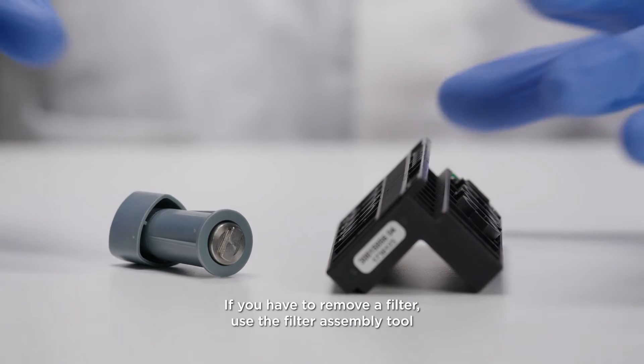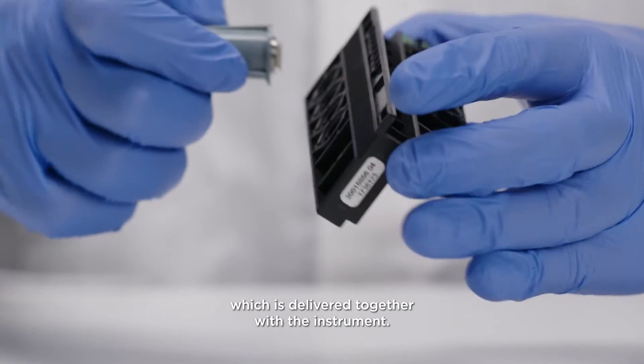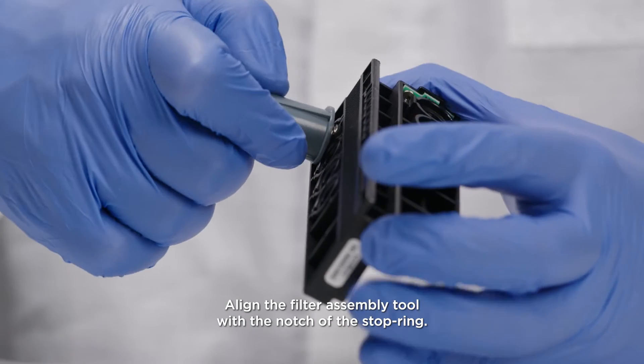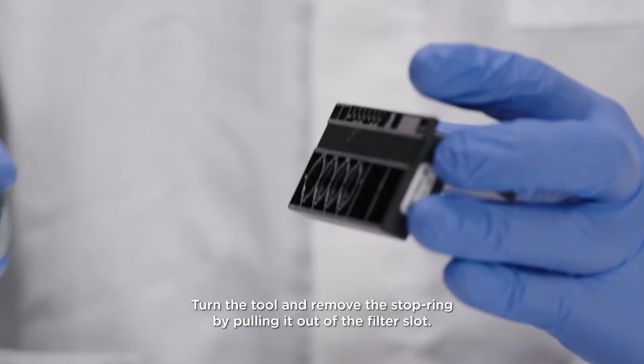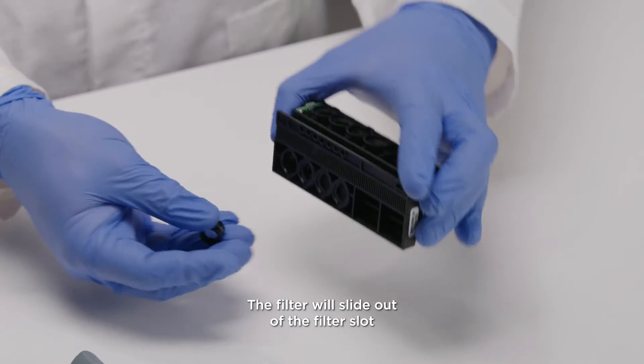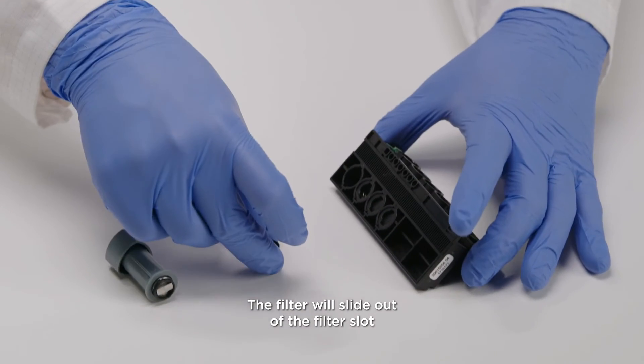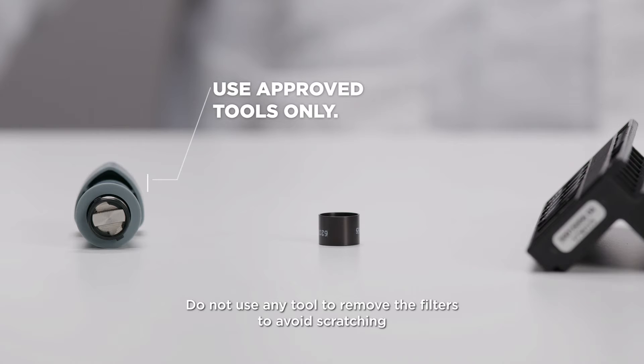If you have to remove a filter, use the filter assembly tool which is delivered together with the instrument. Align the filter assembly tool with the notch of the stop ring. Turn the tool and remove the stop ring by pulling it out of the filter slot. The filter will slide out of the filter slot when the filter carrier is turned over. Do not use any tool to remove the filters to avoid scratching or damaging the filter.